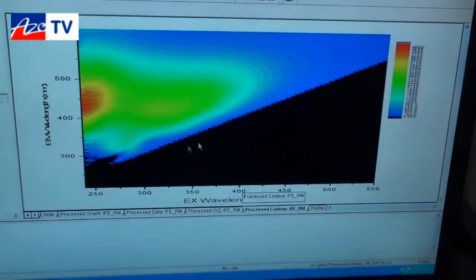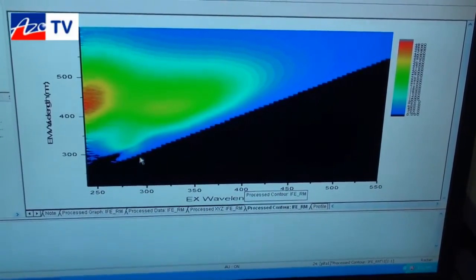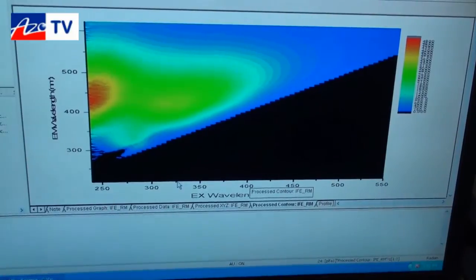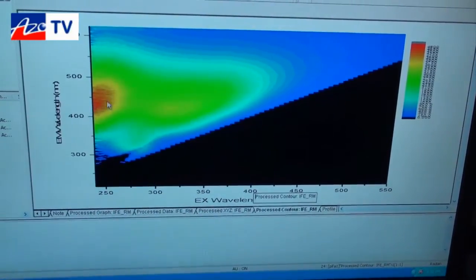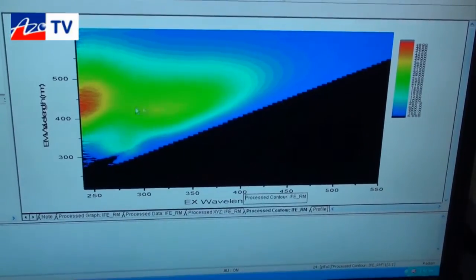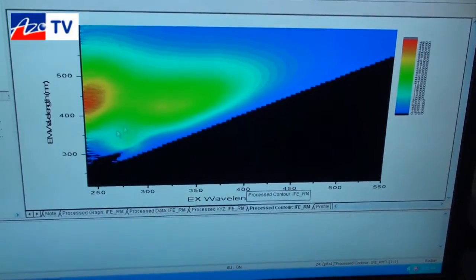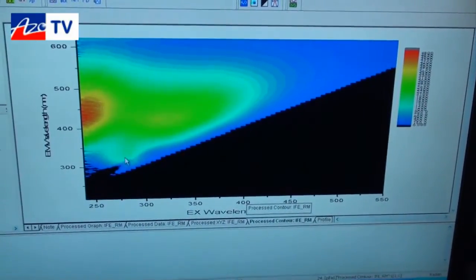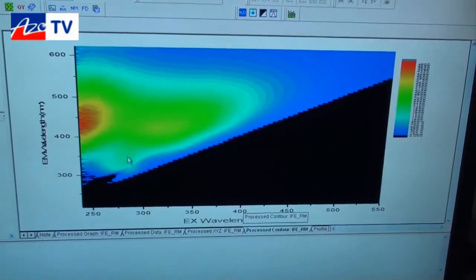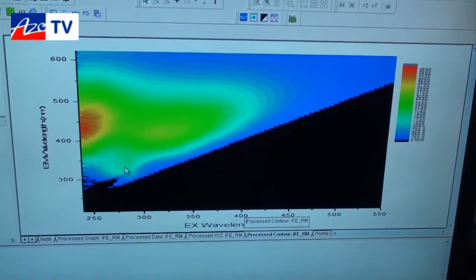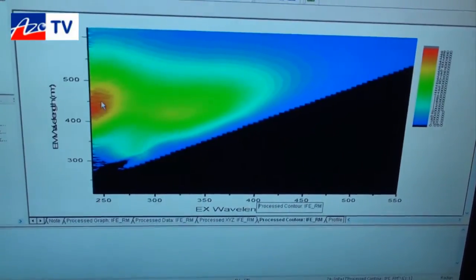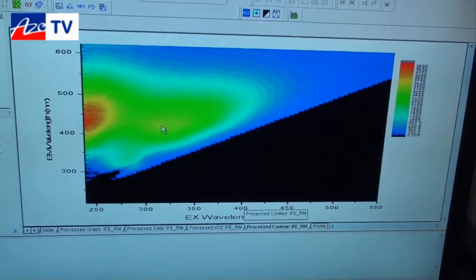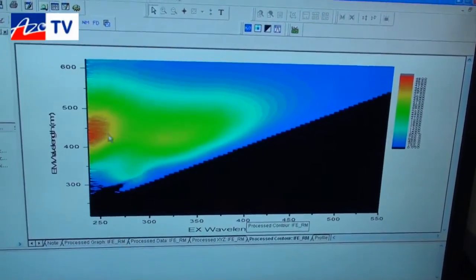So we process the data and end up with a fully corrected spectrum where we've removed the overlapping regions of the excitation and the emission detectors and we've corrected for the inner filter reabsorption effect. So this is the true profile of the composition of the material. This particular sample is noted for containing aromatic peptide residues or amino acid residues like tryptophan as well as fulvic acid. The main component that you see here is the fulvic acid component which is from the breakdown of plants and animal materials in the soil and it gets into the water stream.